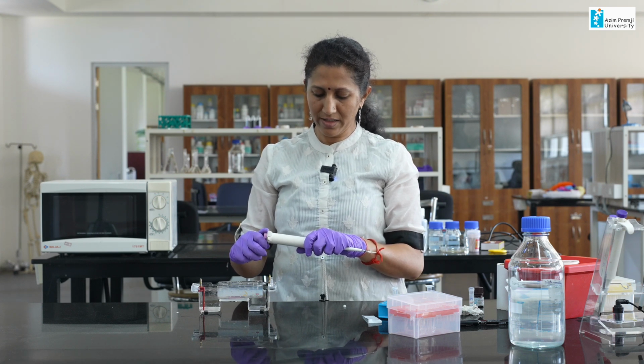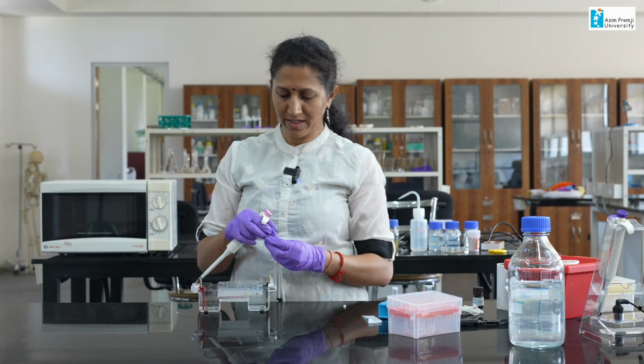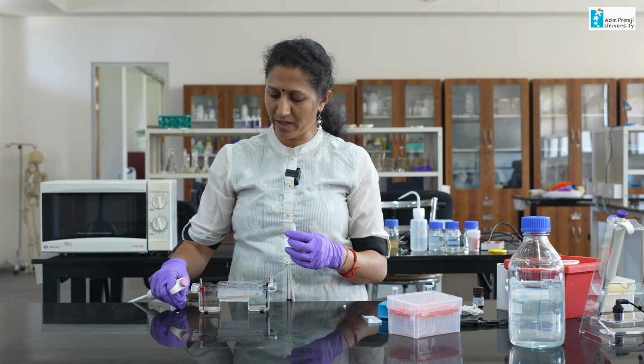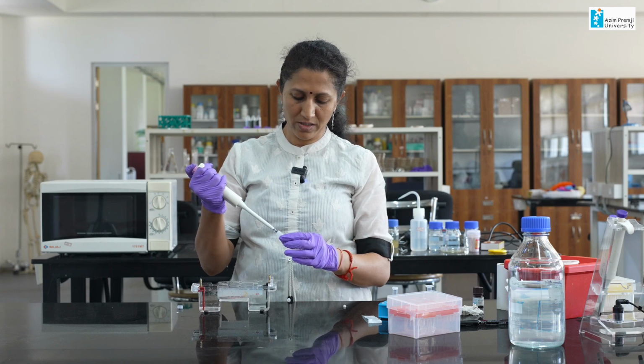In another well I am going to load 2 microliters of DNA ladder. So, the DNA ladder has a mixture of DNA, different lengths of DNA strands, but of known length. So, that when you compare with your amplified product, you know what band you are looking for and can say whether you got an amplified band or not.